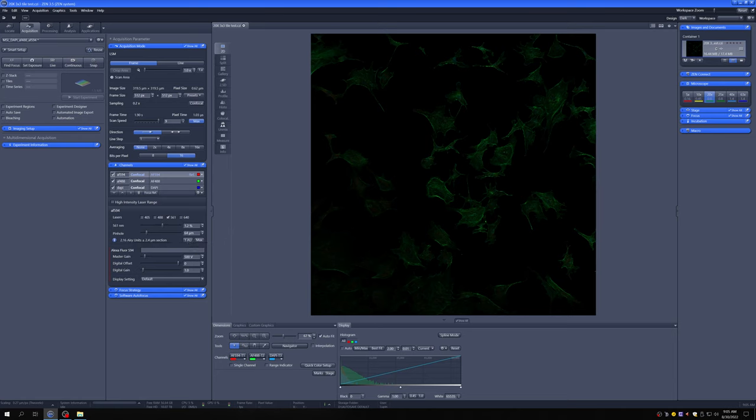This is the diameter of the pinhole in microns, which by itself is hard to interpret. It doesn't really mean anything to us without more knowledge of the optics in the system. This is the diameter normalized to something called airy units, which are comparable across confocals. So it's a very useful way to measure the pinhole, and they also depend on wavelength. So they're normalized to wavelength.